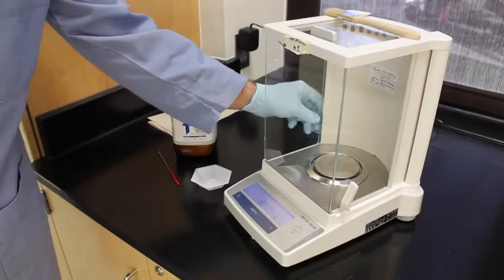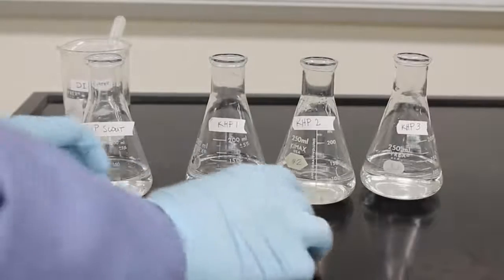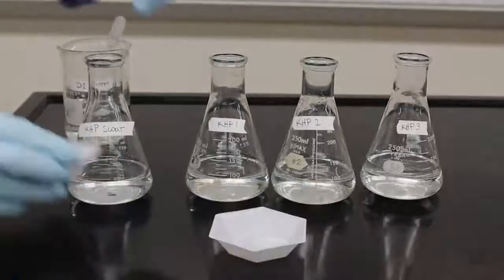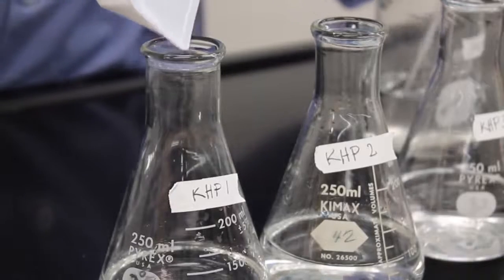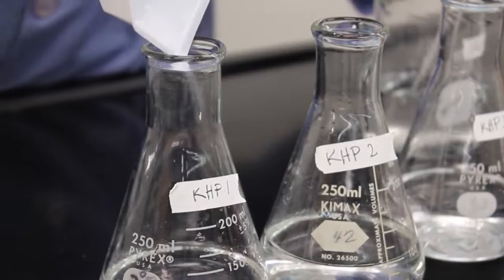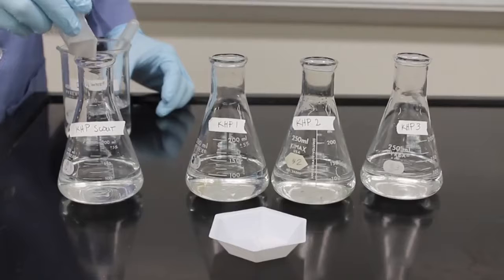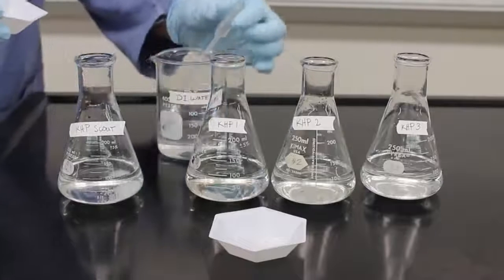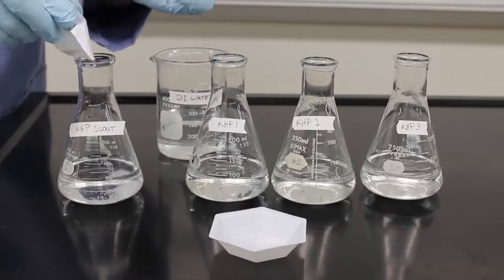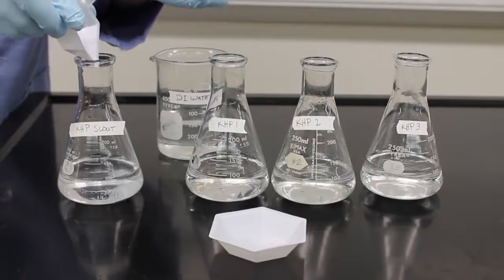Make sure the balance is clean when you are done with it. Next, you will need to transfer your KHP to flasks that contain approximately 100 milliliters of water. The exact amount of water doesn't make a difference, but the exact mass of KHP does. Remember, this is deionized water, not regular tap water. Rinse your weigh boats out 3 or 4 times with deionized water to ensure you get all your KHP transferred.